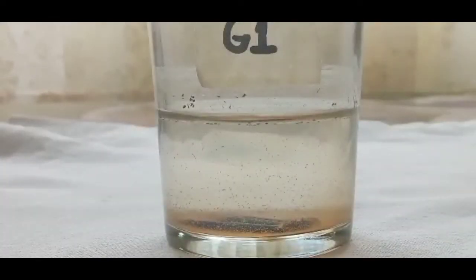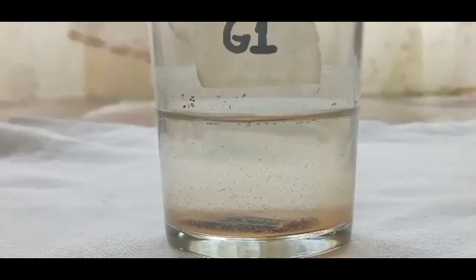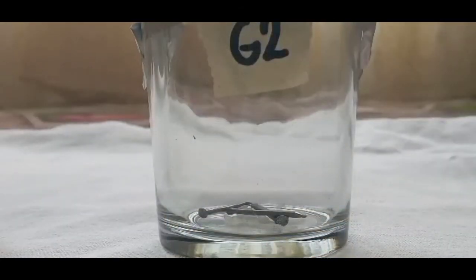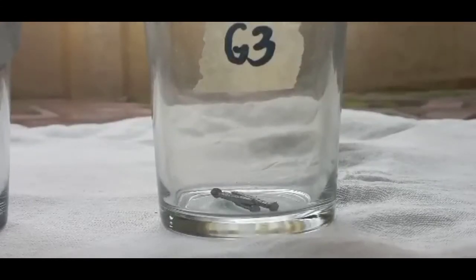In glass number 1, rust is evident because it was submerged in water and exposed to carbon dioxide, resulting in the formation of carbonic acid. There's this breakdown of water which the dissolved iron reacted to the free oxygen, forming this rust. While in glass number 2, nails were unchanged due to nothing influencing it to change. In glass number 3, patches of rust were visible due to its exposure where the location it was placed is near sea.